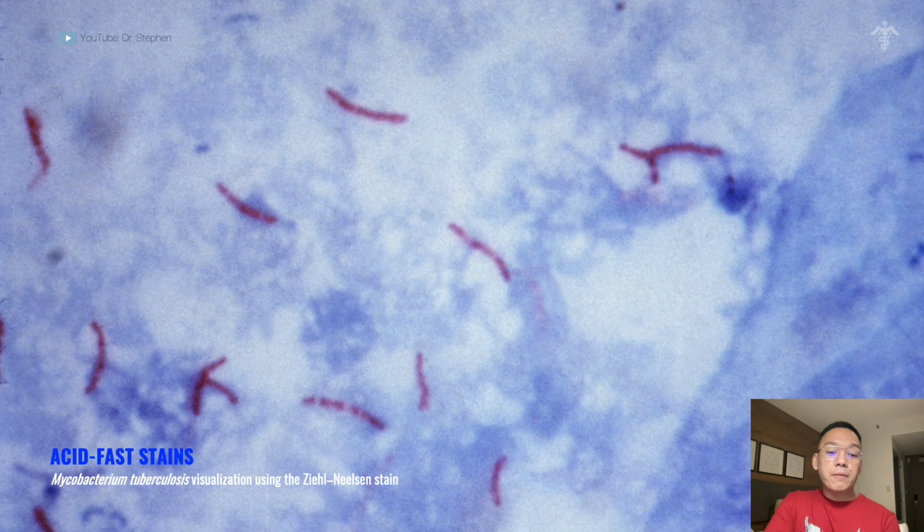Another type of staining is what we call the acid-fast stain. This is used to stain mycobacteria and other acid-fast organisms. Organisms are stained with basic carbol fuchsin, and they resist decolorization with acid-alcohol solutions. The background here is counterstained with methylene blue. Your target organisms will appear red against the light blue background.